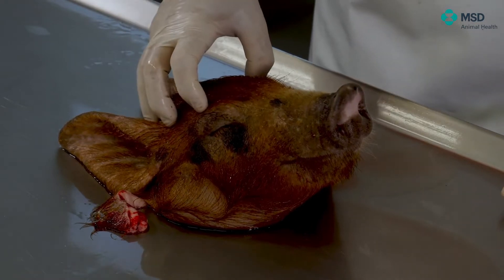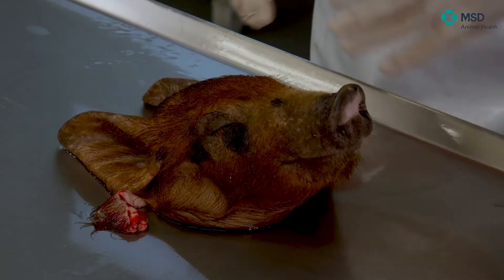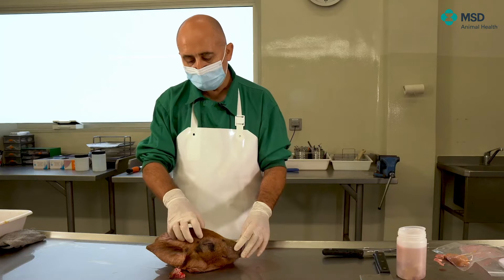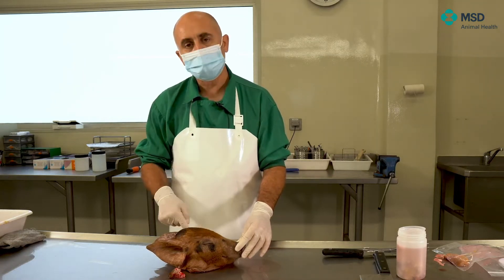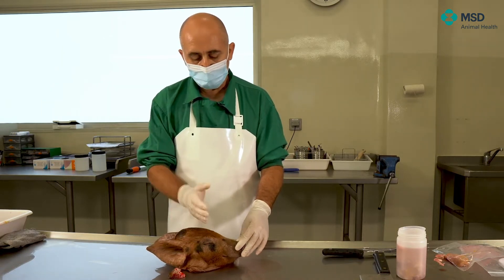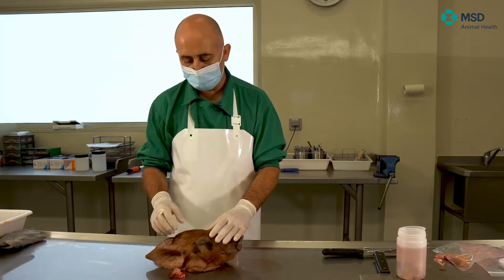However, first of all, we will try to remove the brain. For doing so, there are different systems. In our case, you will see that we are taking the whole brain and just crushing a little bit the bones of the skull. We will maintain the part of the nose intact, so we will not touch it.